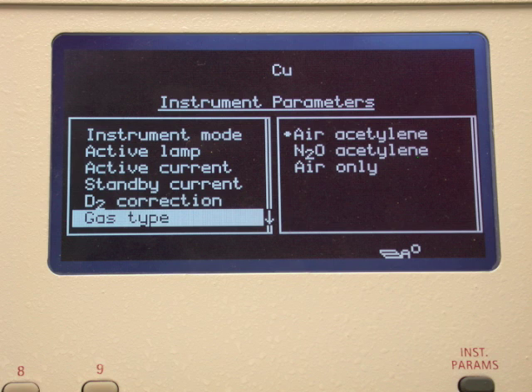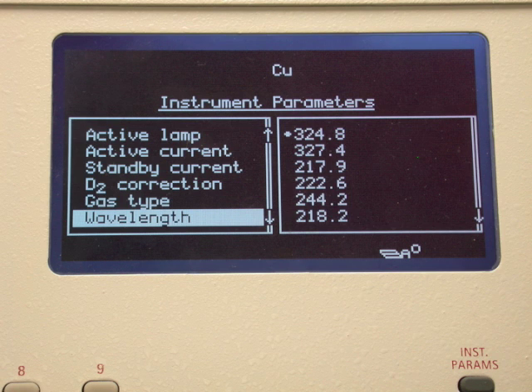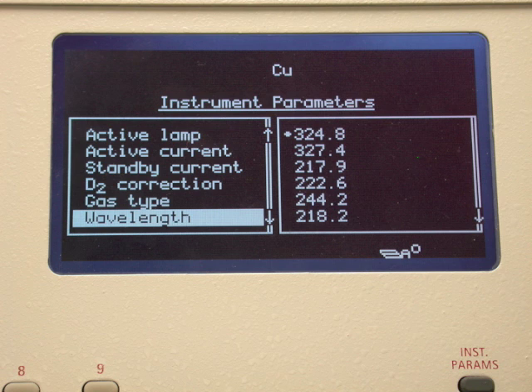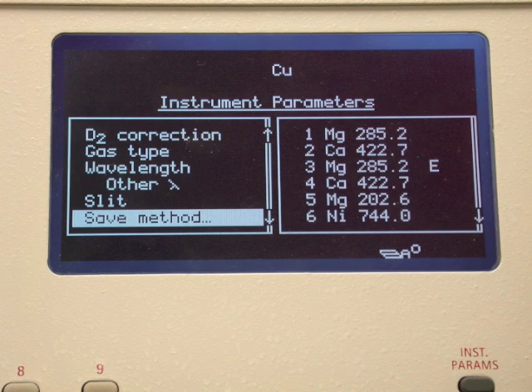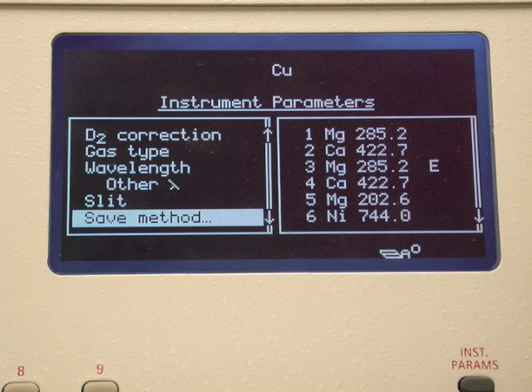Our instrument is set up to use a mixture of air and acetylene to produce a flame. Be sure that this is the combination on the right-hand side and press enter. The most commonly used wavelength for the element of interest is listed at the top. Other wavelengths can be chosen; one of these may be more appropriate in situations where a second element interferes because of a coincidentally nearby absorption line. We will use the default value for the wavelength and also for the slit width. You may save these parameters as your own special method, but we will not do that today.